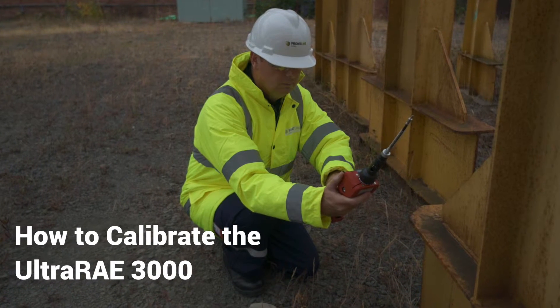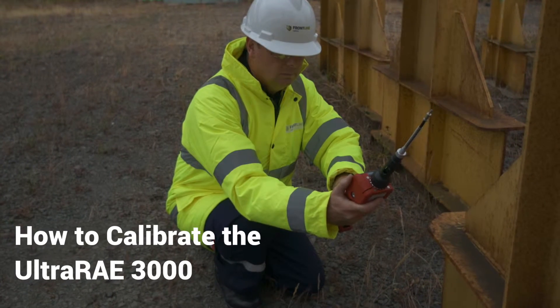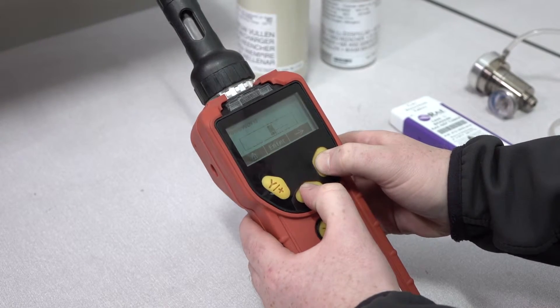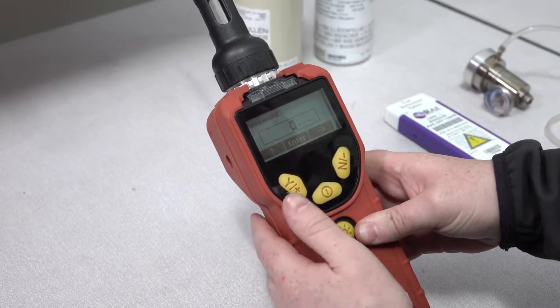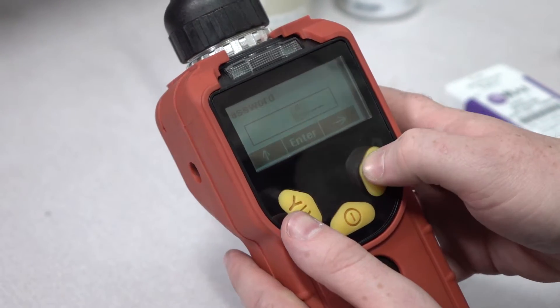In this video we're going to show you how to quickly and easily calibrate the Ultra Ray 3000. To access the calibration menu, press and hold these buttons on the front of the device and then enter the password. By default this is set to 0000.